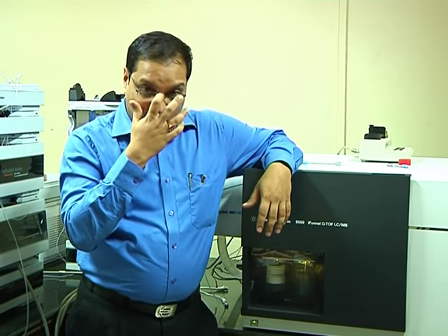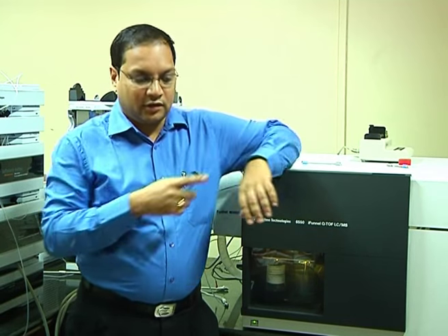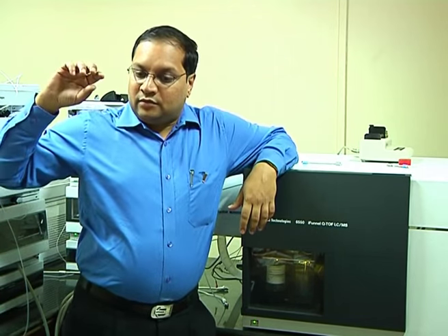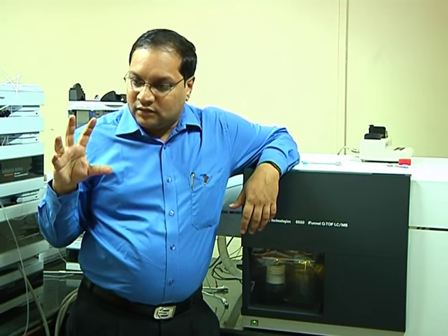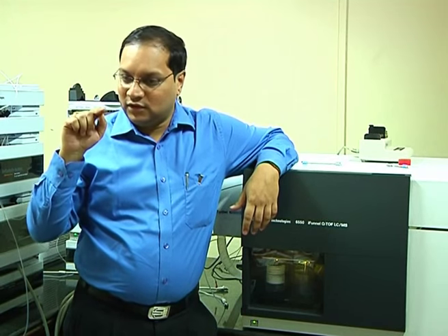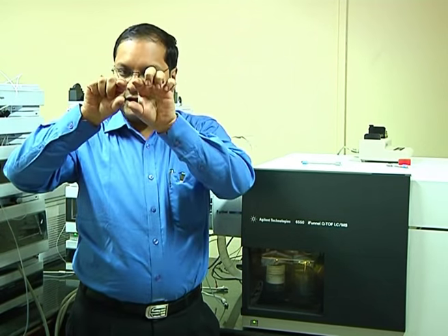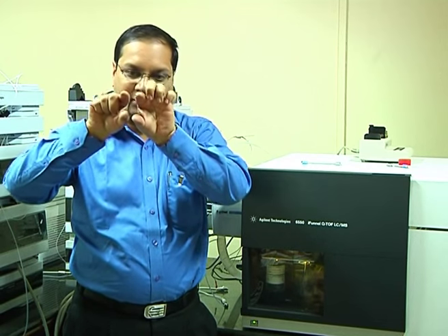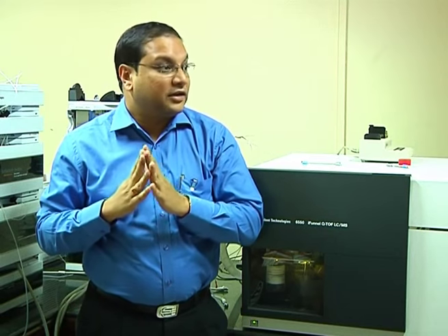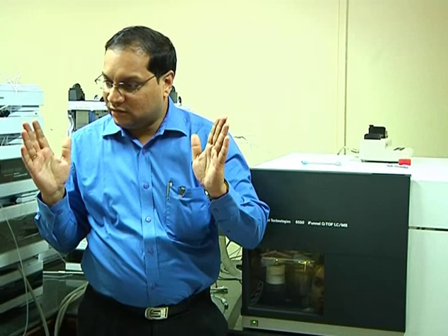Okay. So quadrupole is also called a mass filter. It's also called a mass filter analyzer because of the way it behaves. Quadrupole is what? 4 rods. So 4 rods like this, positioned like this, at some length. Okay. So what is the logic? It is also called a mass filter. Why? Because it has the ability to filter mass.